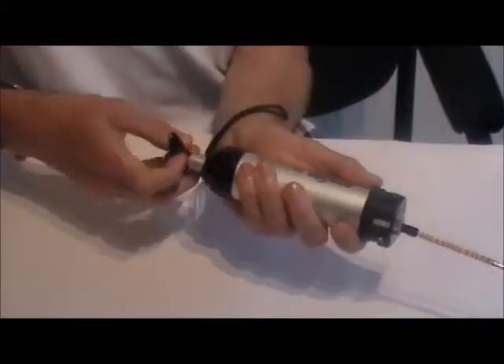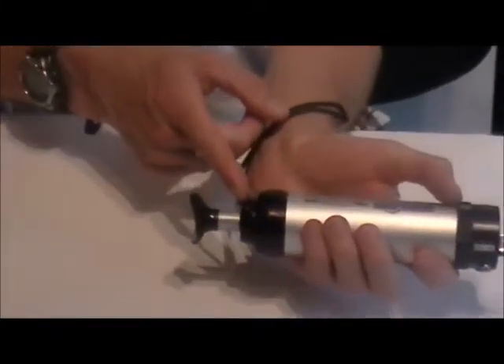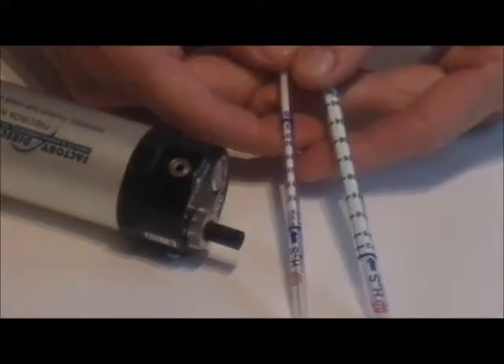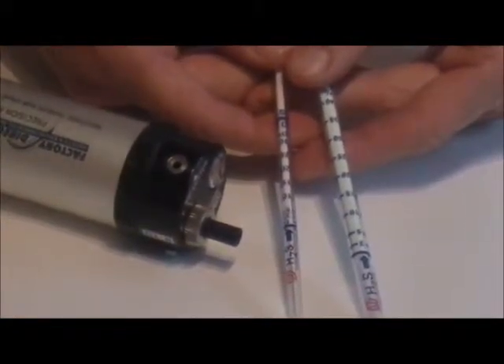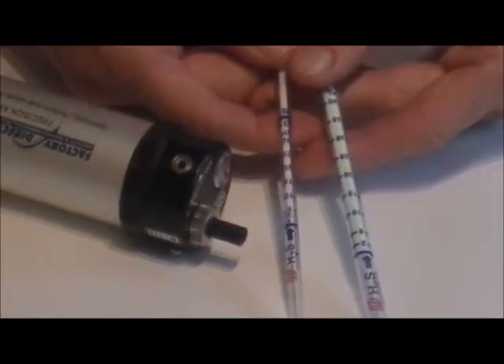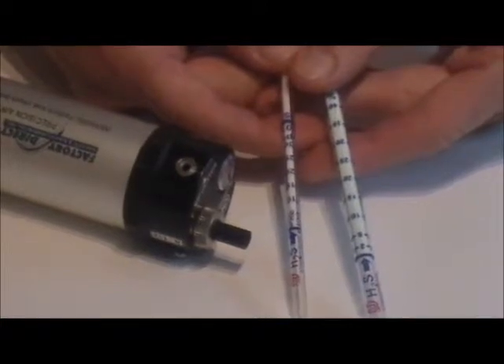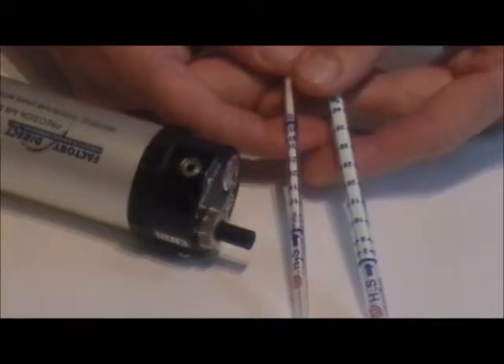The pump, if it has a good vacuum seal, should return to the original red line, indicating that there is no vacuum loss and the pump is ready for use. It's also important to do a leak check when changing from different types of tubes, especially tubes of different diameters, because the seal on the inlet may vary in integrity depending on the diameter of the tube.